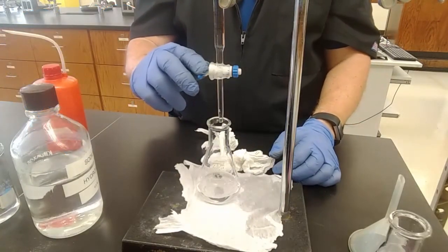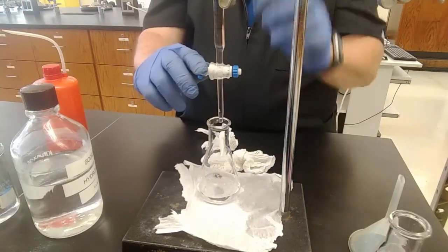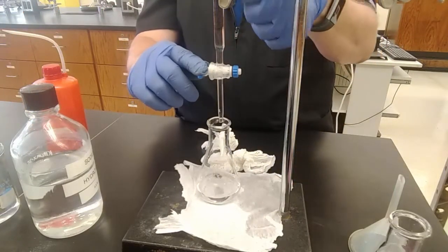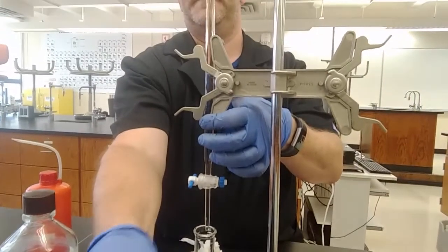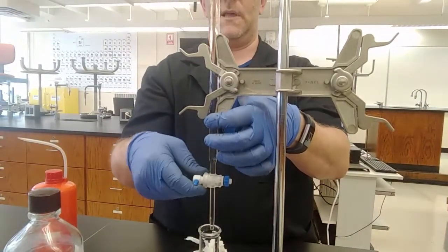I know that it's going to take about 17 milliliters, so I'm going to go rapidly up to 18 again. Just putting my finger on it so that I know where to stop. And I'll just let her rip.